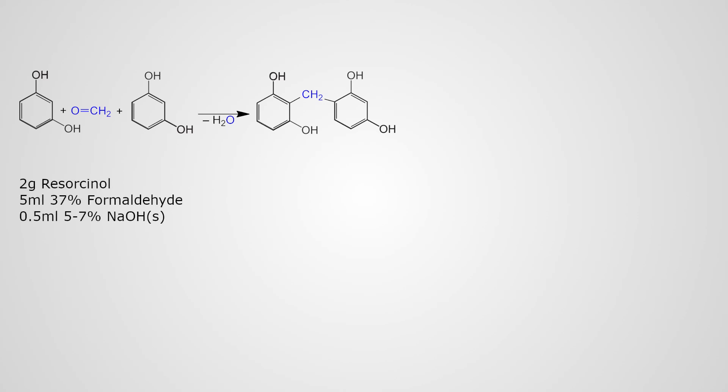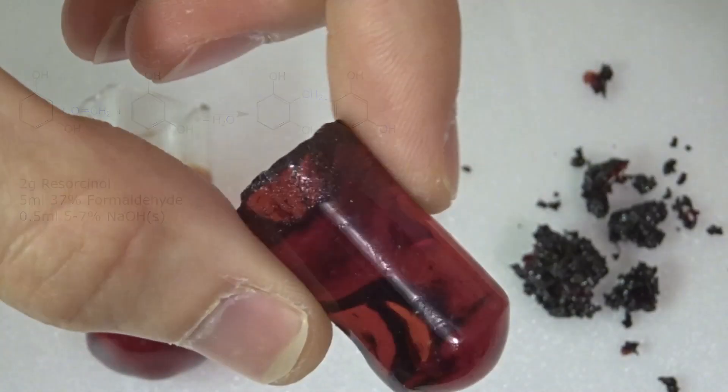And now for the reaction mixture. I used 2g resorcinol, 5ml of 37% formaldehyde, and a 5-7% sodium hydroxide solution. It is important that you get the concentration right, because the concentration of the sodium hydroxide solution determines how fast the reaction will go.